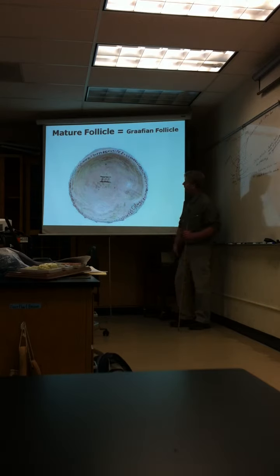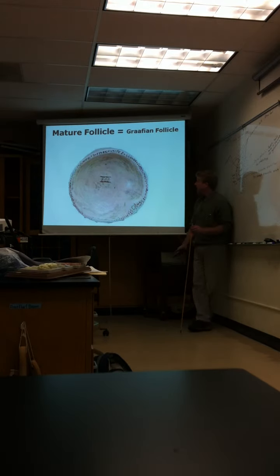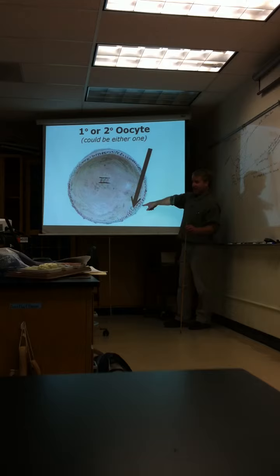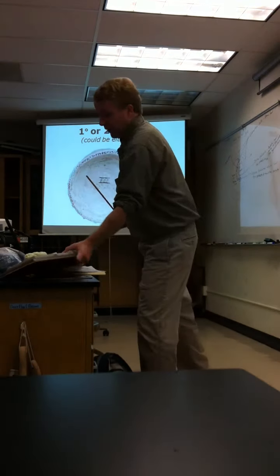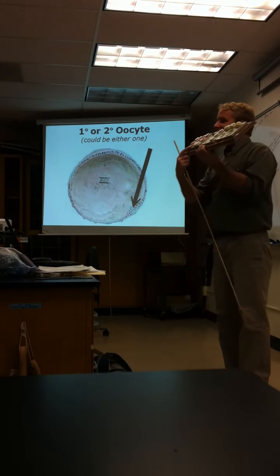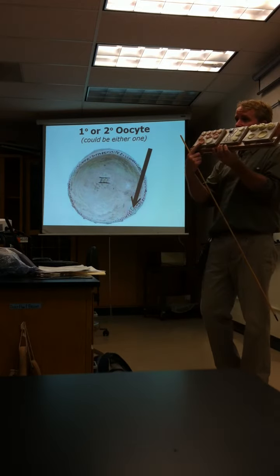This is the mature follicle that we will not be looking at in the microscope. You do need to know mature follicle in the models, but not in the microscope. And so let me move on to, just to also emphasize, if you have this model, and when you're looking at this model, probably the best thing to do when thinking about the oocyte is these are all primary oocytes. Then it's in the mature follicle, this one, where that primary oocyte becomes secondary oocyte.